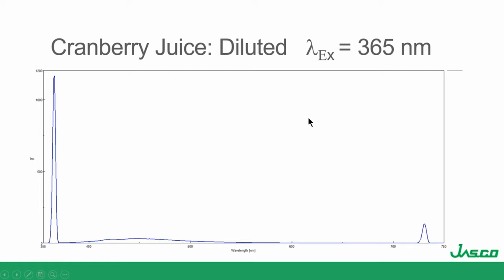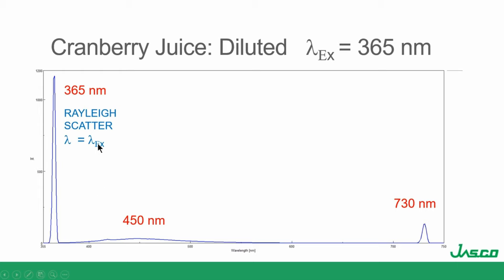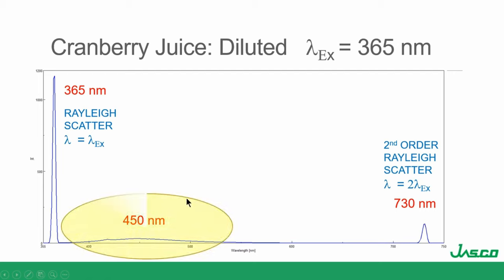This is diluted cranberry juice. The big band at 365 nm — that's just Rayleigh scatter, lambda equals lambda excitation. At 730 nm, that's second order Rayleigh scatter at double excitation. The band at 450 nm — what is it? It could be fluorescence. But it could also be Raman, so we need to check it further.